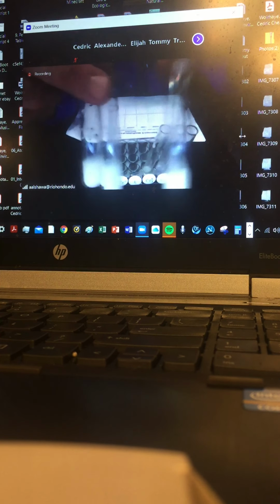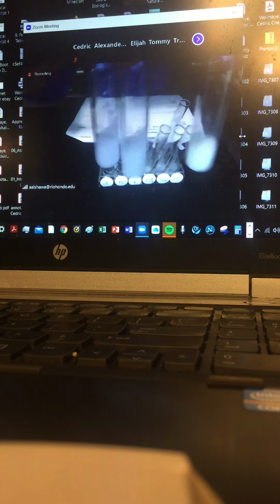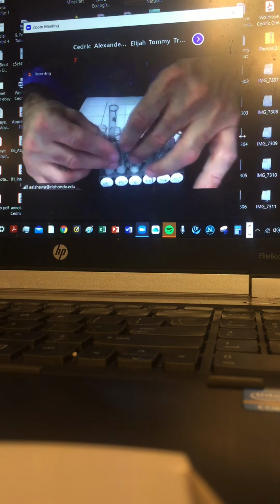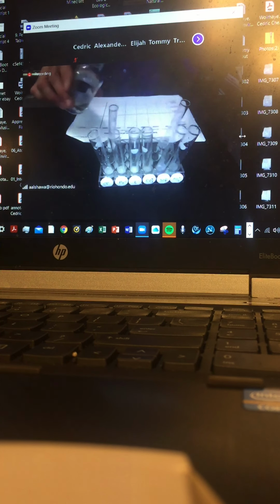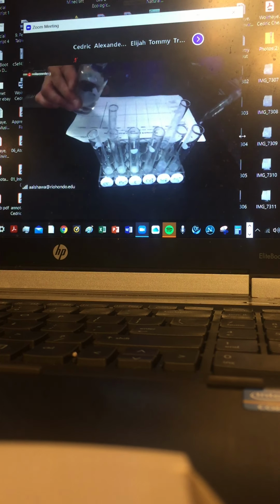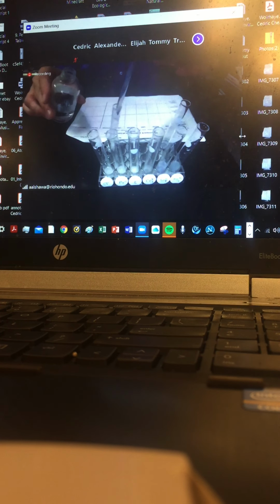So they sustain their own precipitate. That precipitate, that white background, remains in solution. Now I want to add nitric acid to those. Once again, the molarity of it may not help, but let's hope for the best. I'll do the same for the unknown.